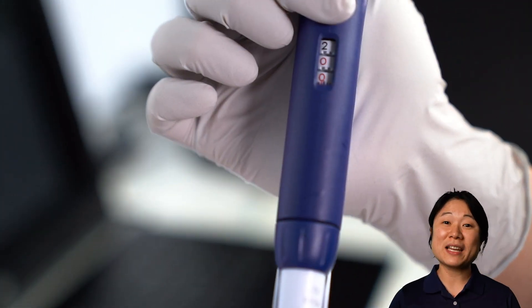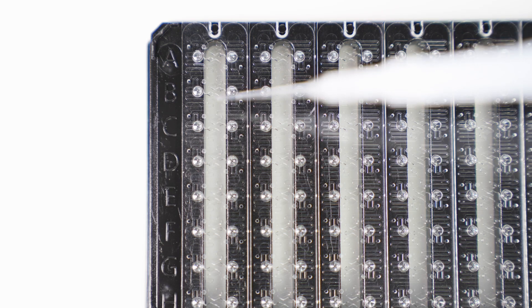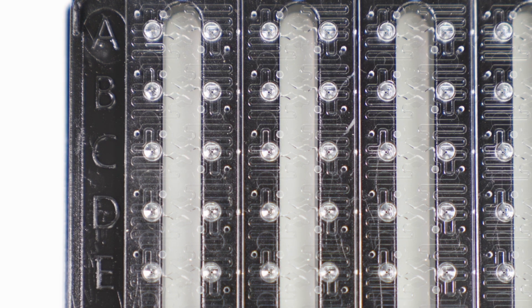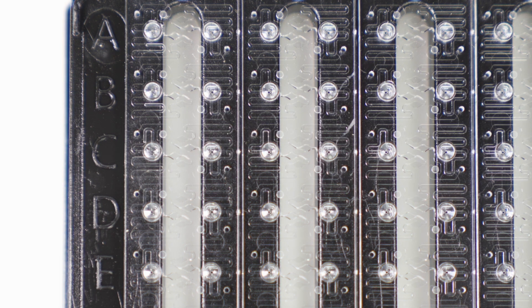Each replicate only needs 2 µL of sample. The sample moves from the well into the microfluidic circuit after it's pipetted. Here you can see the sample moving into the circuit.